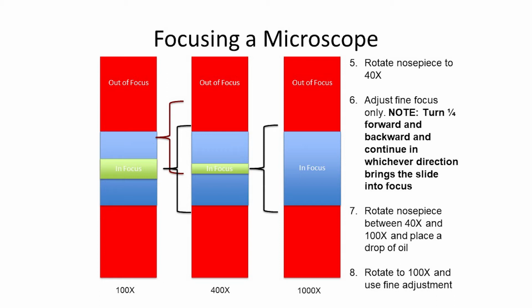And the same thing is true here. If you go up to the next power, you are even more likely to be slightly out of focus, so you'll have to do some adjustments there.